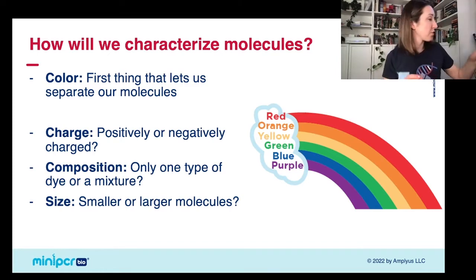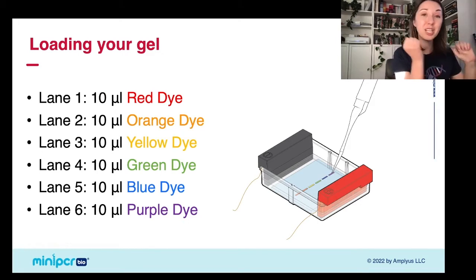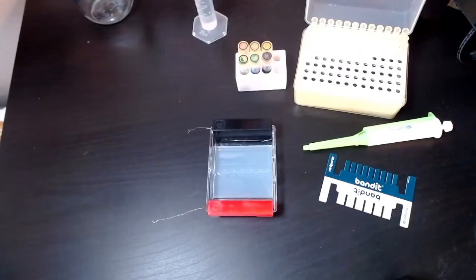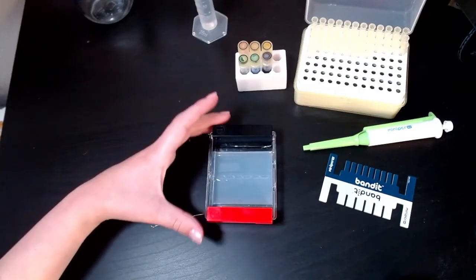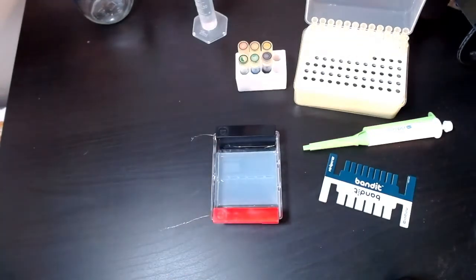Now, again, we're going to walk through the actual fundamentals of this in just a minute, but I want to make sure that we get this demo started, we get things rolling. So the first thing I'm going to do right now is switch to my benchtop setup, and we're going to load our dyes into our gel electrophoresis setup. So over here, we have our little gel electrophoresis box. This is our Bandit gel electrophoresis kit from Mini PCR Bio. We're going to talk all about this in just another second. But before we really get into the specifics here, I want to make sure we can load our dyes into this gel and start walking through this lab.